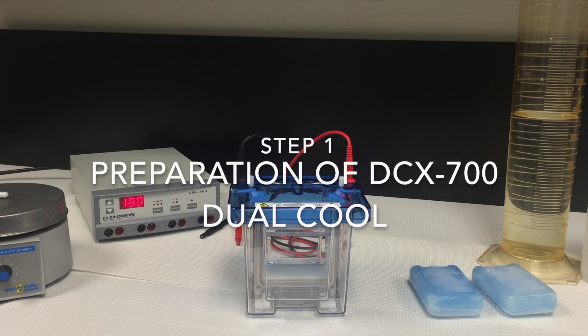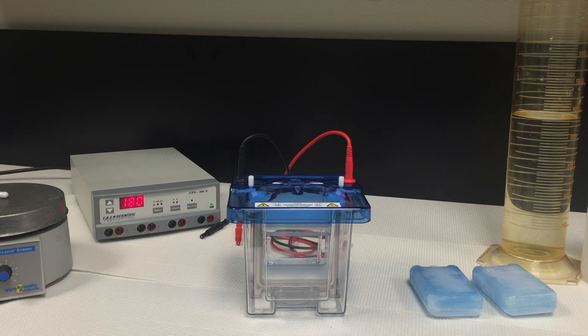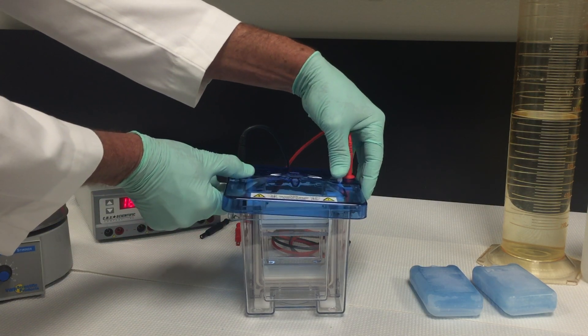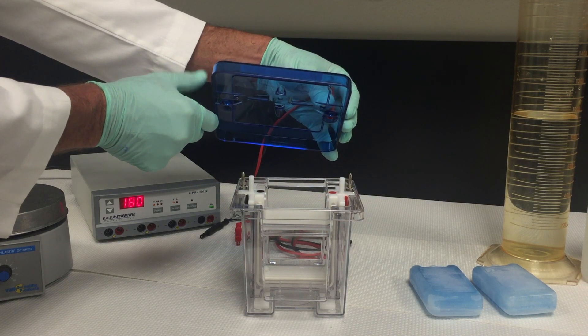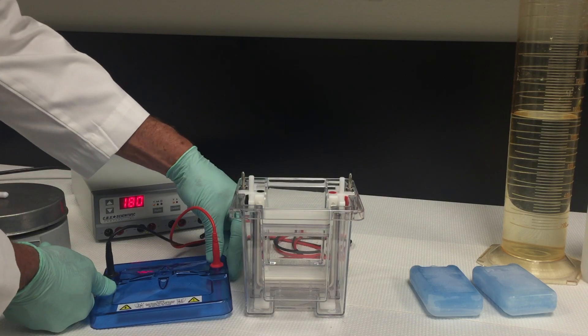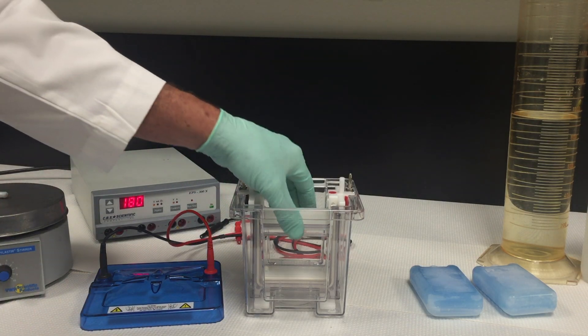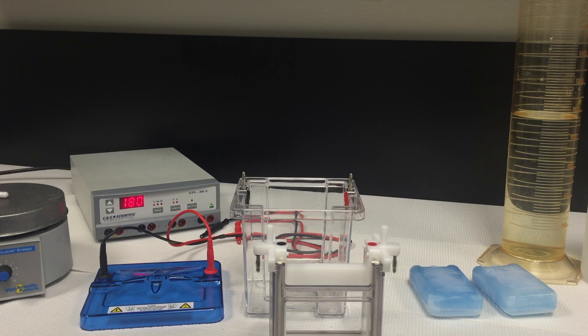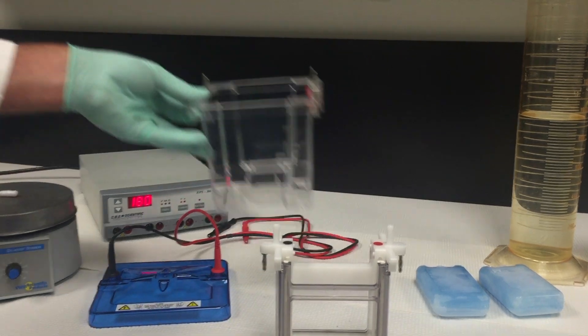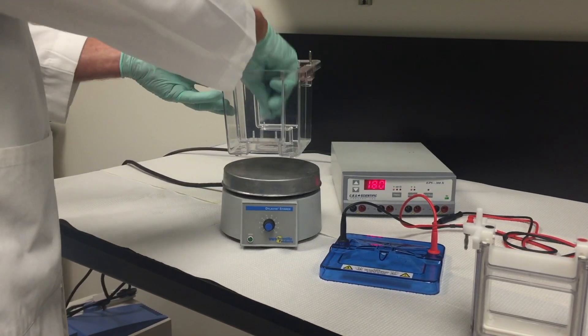Step one: prepare the DCX700 unit. Before running the first gel in the DCX700 Dual Cool unit, please read the instruction manual for important safety and general use instructions. To open the Dual Cool, push thumbs down on the white clear posts while pulling the lid up with fingers under the lid. Do not pull on leads. Remove the safety cover and place the core on the bench top. Place the unit on a stirring platform and place a stir bar into the base of the unit.